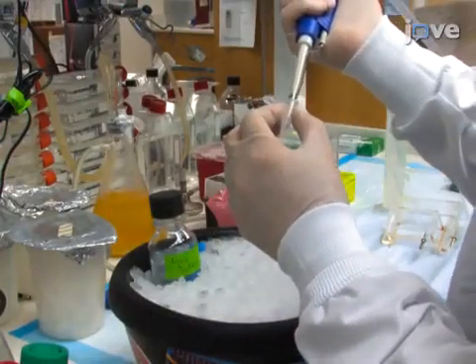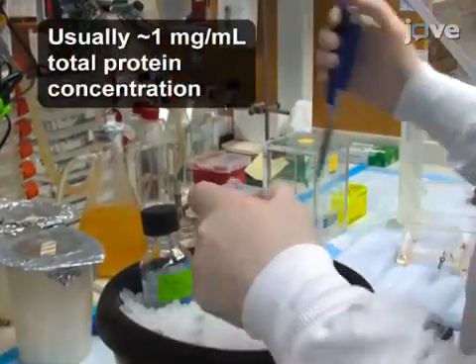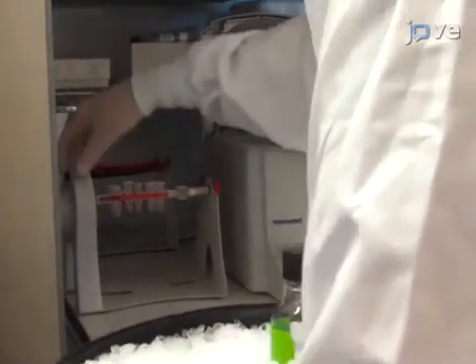To begin, add 2 microliters of 1 milligram per milliliter antibody to 200 microliters of cell lysates and incubate at 4 degrees Celsius for 1 hour while rocking.